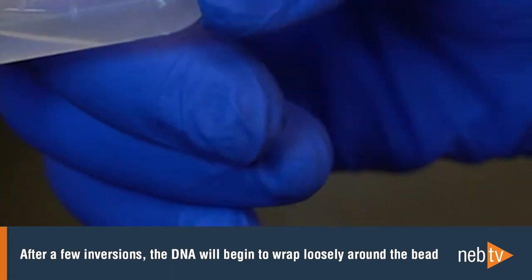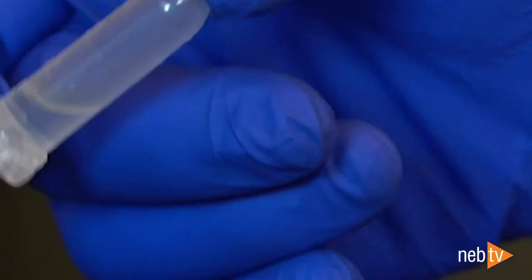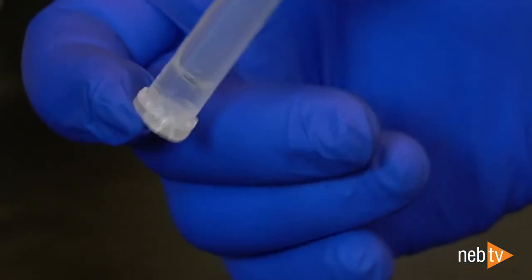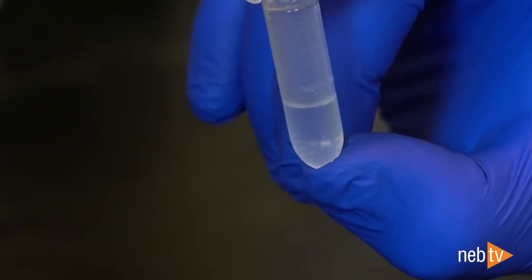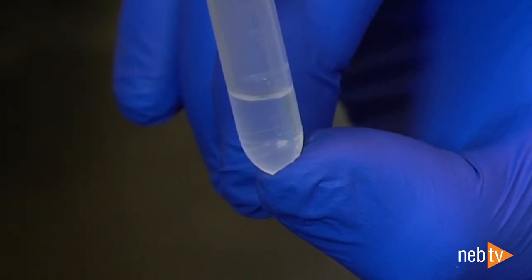After a few inversions, the solution becomes more viscous and the DNA will wrap loosely around the beads. During the following inversions, precipitation of DNA may be visible, especially with larger sample inputs. The DNA complex will often contain small air bubbles, and with more inversions the DNA will completely wrap around the beads, often causing them to stick together. Once the DNA is completely wrapped around the beads, the viscosity of the solution will drop back to normal levels.